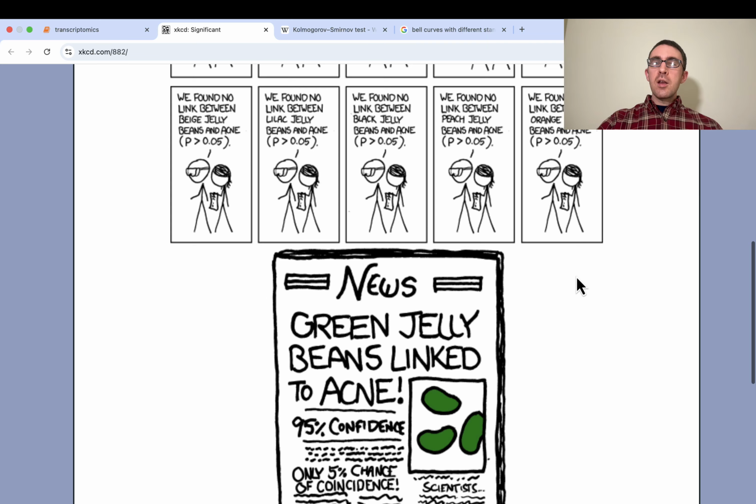So just going to be defining some empty lists here to save our p-values and log2 fold changes. Again, epsilon is a small constant to avoid division by 0, since we're taking the log. And then a for loop to go through every row in our data matrix. For that row, we'll split up the control and IPF conditions.